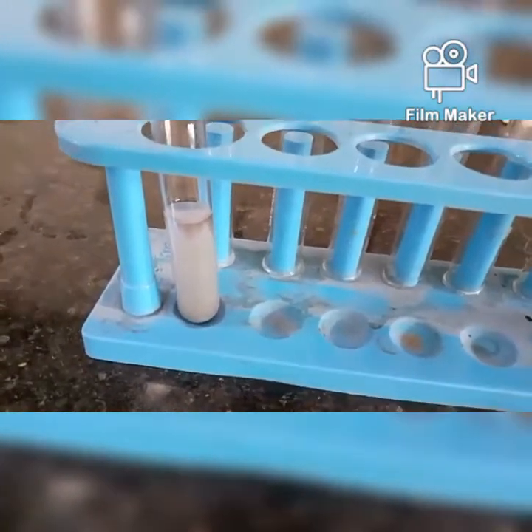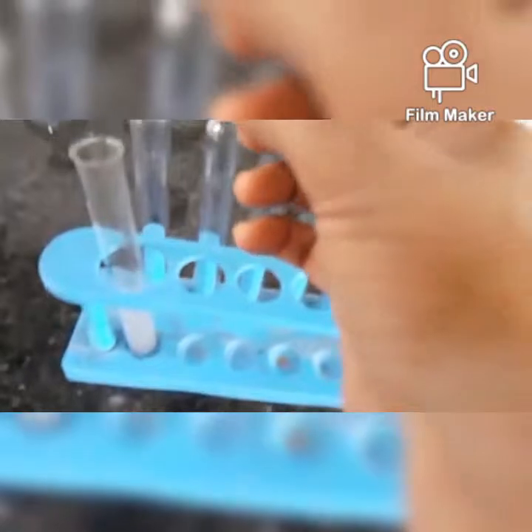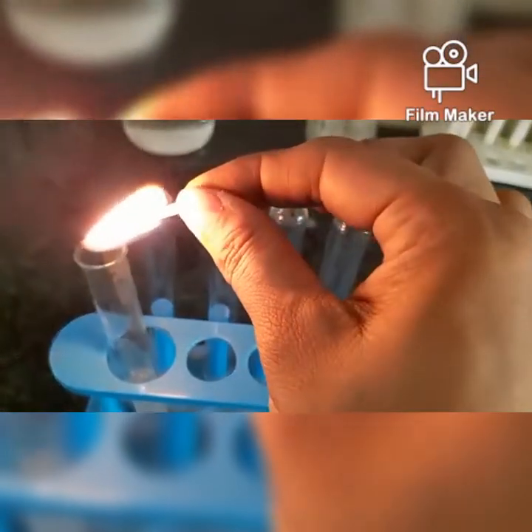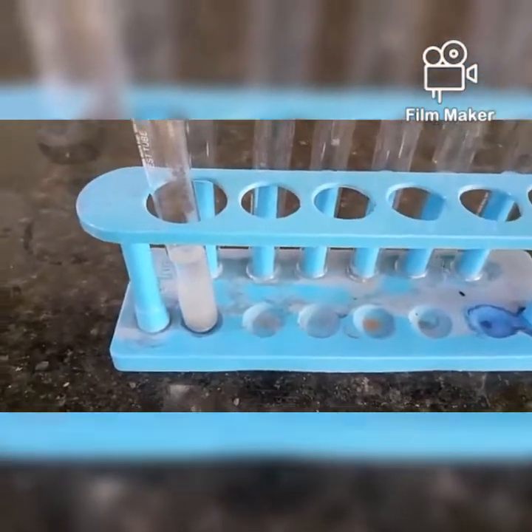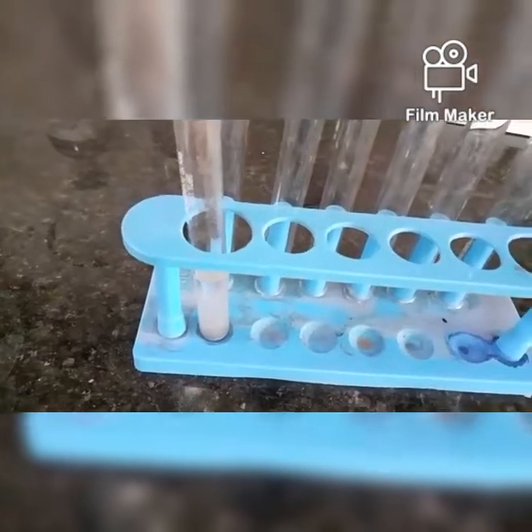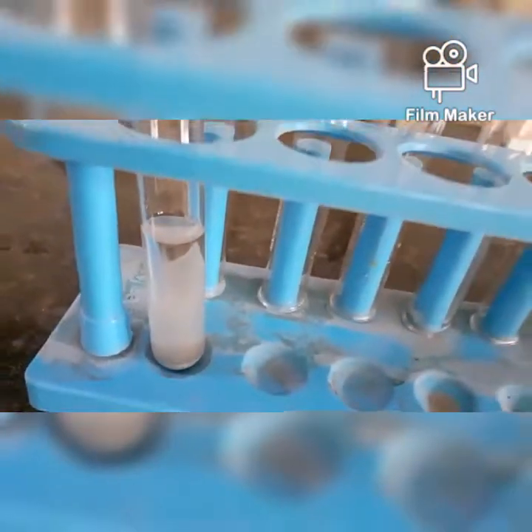Let's check if any gas is released. Let's check the presence of hydrogen. There was no pop sound, so we can say that no hydrogen gas is released, right? So bases basically don't release hydrogen ions as such. The zinc dust has settled down.